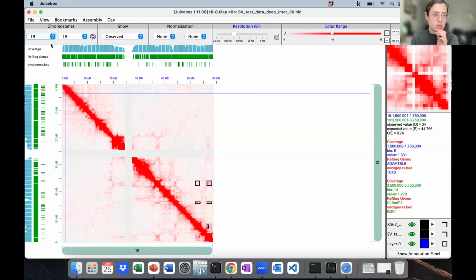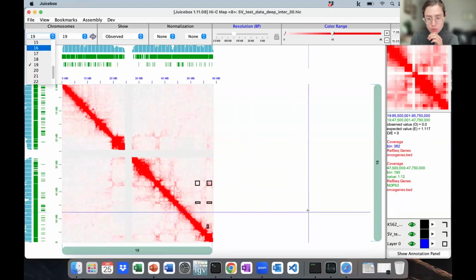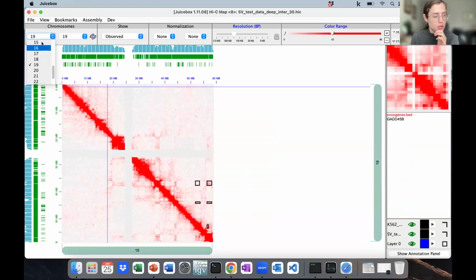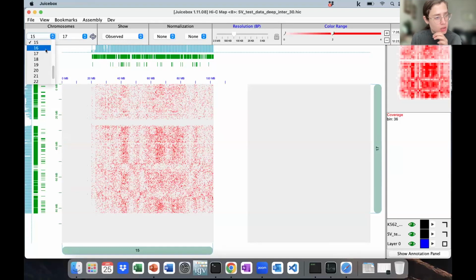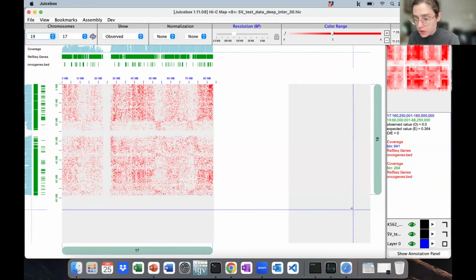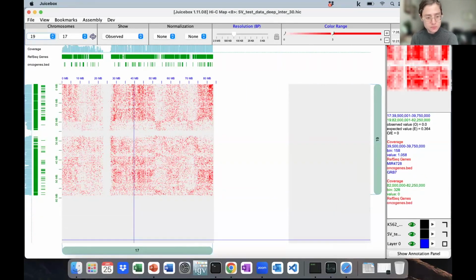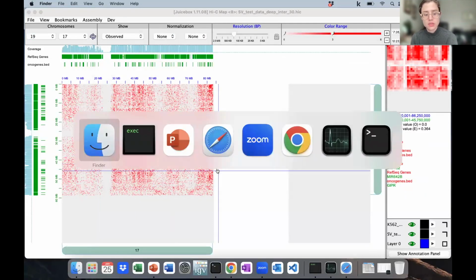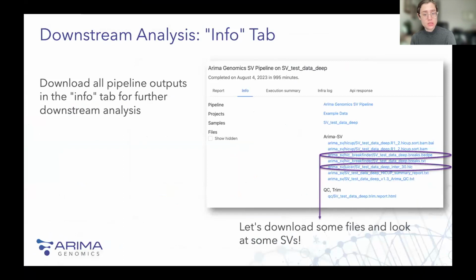And the last example that I want to show you is another type of false positive, which is called a low mappability false positive. And let me see, is it here? Okay, I forgot where I put this false positive. I'm really sorry, just never mind. Let me see if I have it in my presentation.